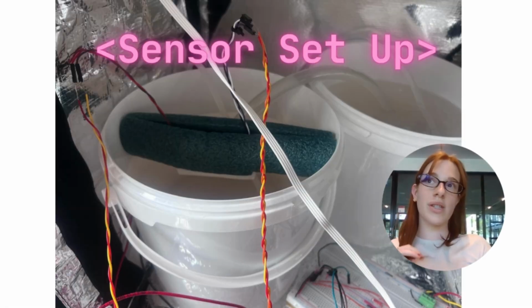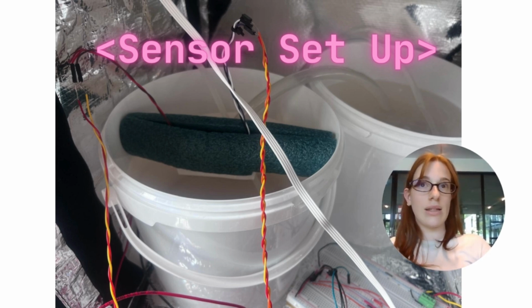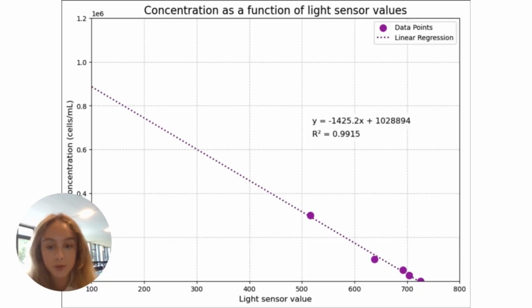We tried different resistances on the light sensor and on the LED, and we ended up picking a dark tape to put over the LED to avoid maxing out the sensor. In the experiment, we calibrated our OD sensor by starting off with measuring the clear water, and then we added more and more algae concentration, and we obtained a blank value of 725. As you can see in the plot, it shows a negative linear relationship between the light sensor value and the concentration.